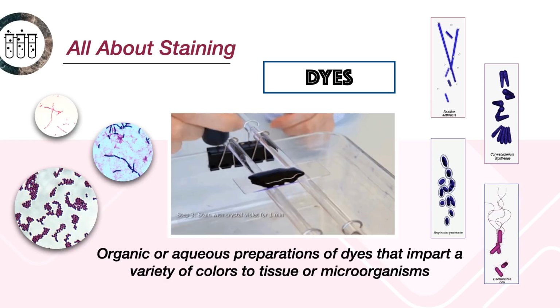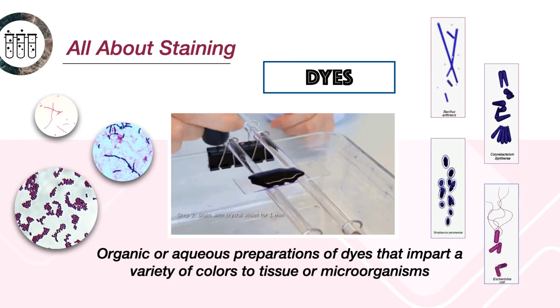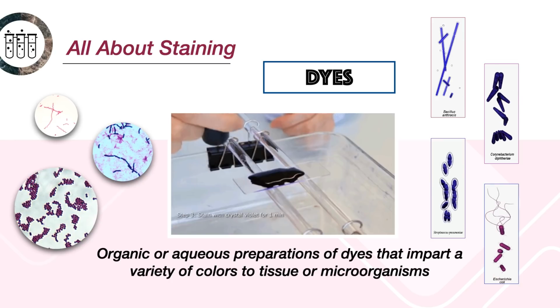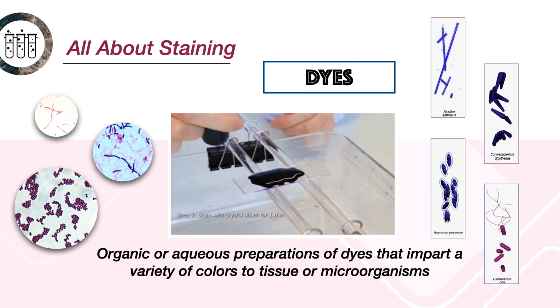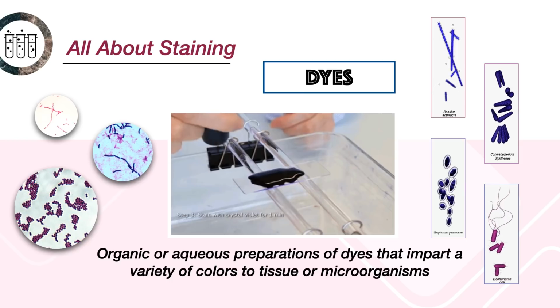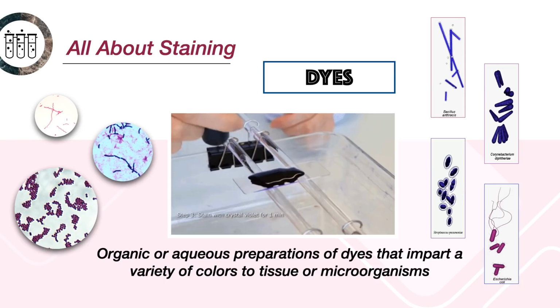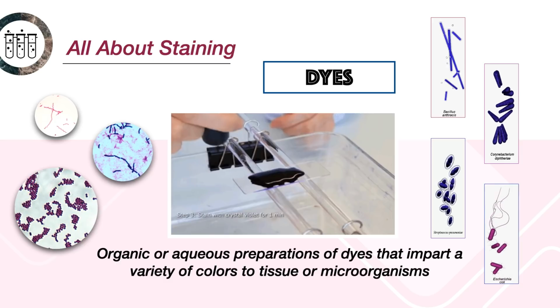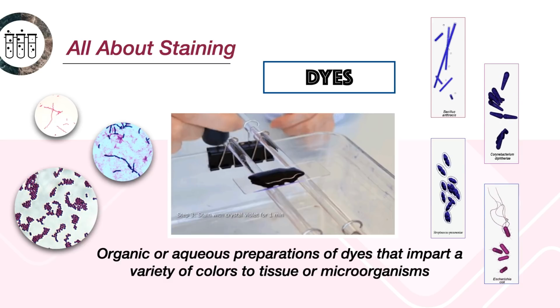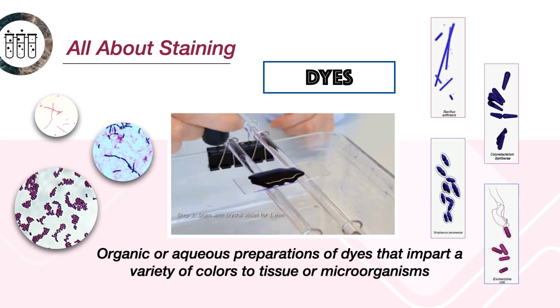Or further, do you want to see the different types of structures to identify whether or not these bacteria possess the structures that would make them unique? Or, to make it a more complex goal, what do you want the staining procedure to accomplish? Do you want to differentiate the different types of bacteria found in the sample?